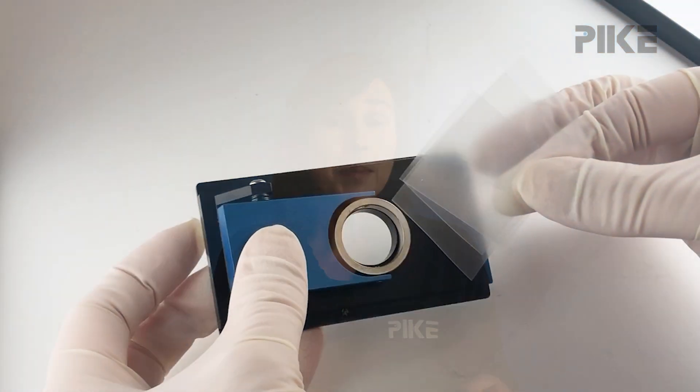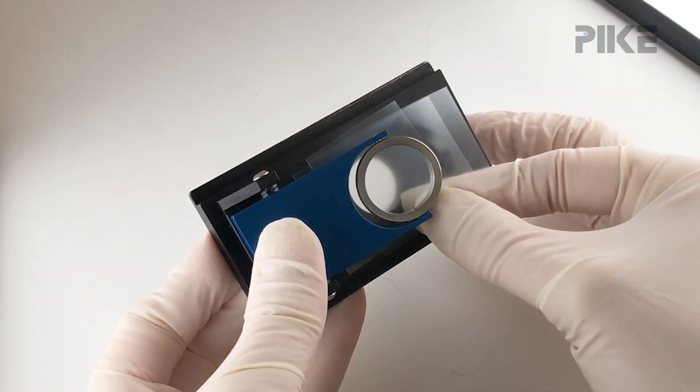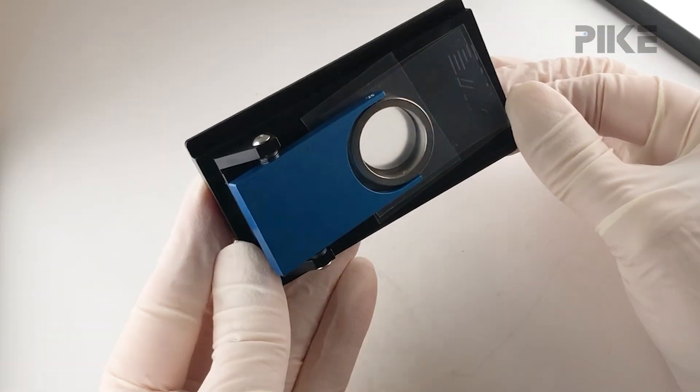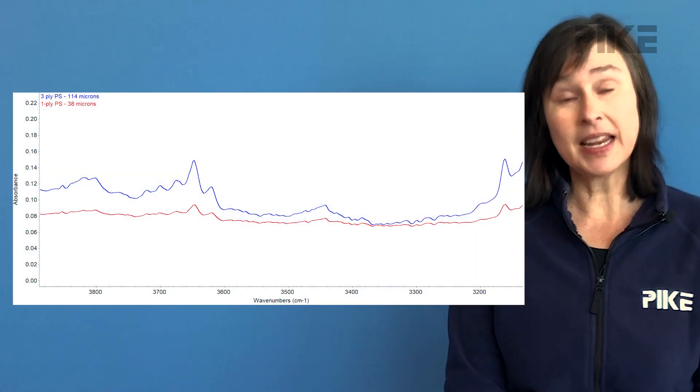Well, keep in mind absorbance is proportional to the sample path length. So let's just increase that sample path length. When you're making film measurements, one of the ways you can do that is double up, triple up, or more the layers of film. And now you can see the difference it made in the absorbance band strength.